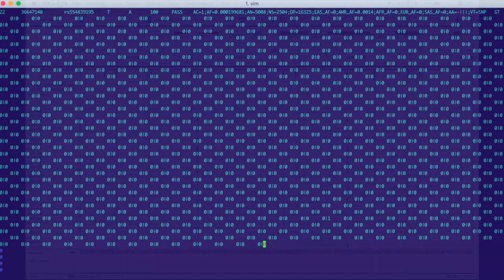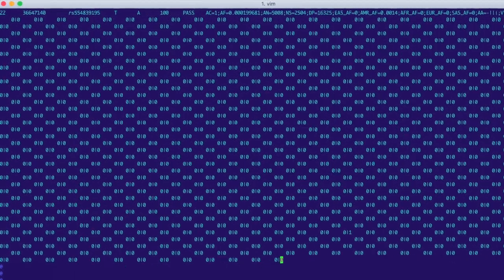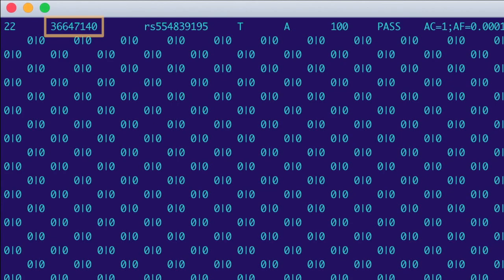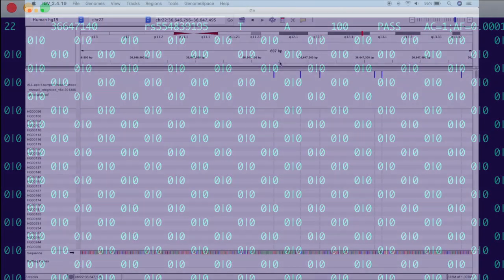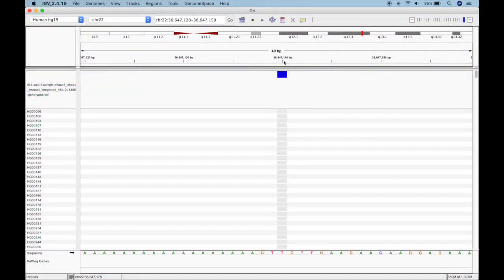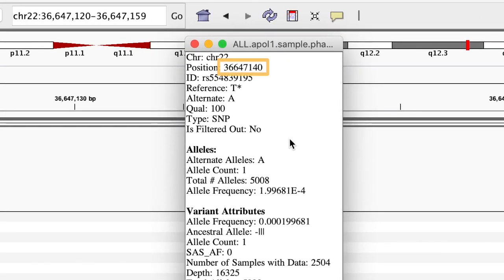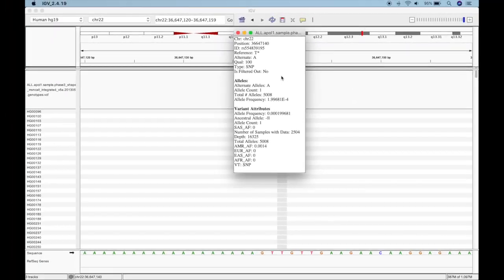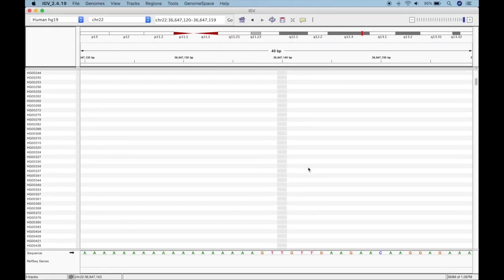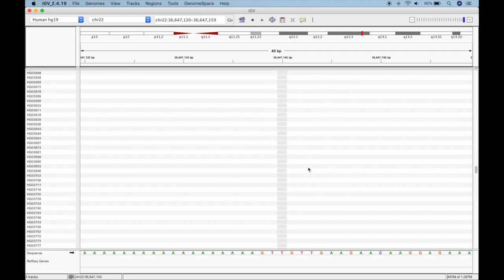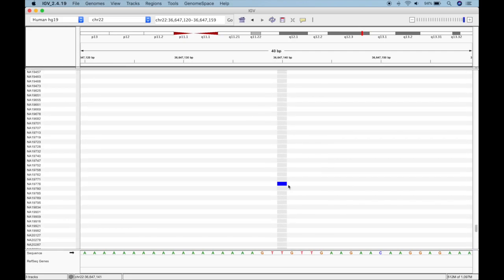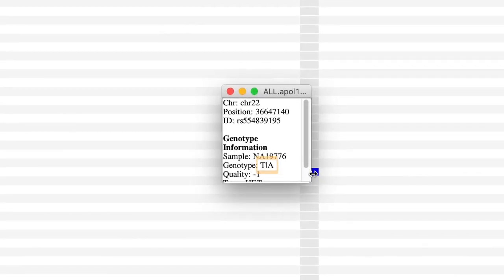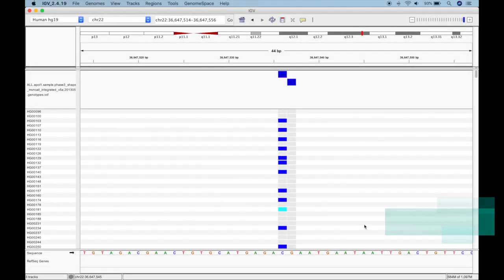If we go back to our VCF file, we can see our first variant is on chromosome 22 at this location. And if we zoom in to where our variants begin on chromosome 22, we can see a variant at that exact position. Which means if we scroll down, we should see that one sample with the heterozygous genotype. And there it is. Pretty cool, right? Now that we understand where the data is coming from, let's talk about color.